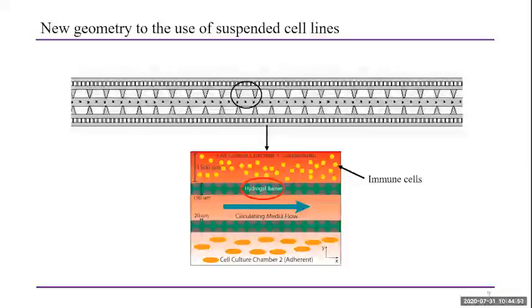So we need the 2 separate types because tumors are made up of heterogeneous microenvironments. And so it's not just cancer cells, it's many different types of cancer cells. And we also have immune cells and stromal cells. And so we're trying to see how that cell-to-cell communication works that drives the cancer progression in the tumors.